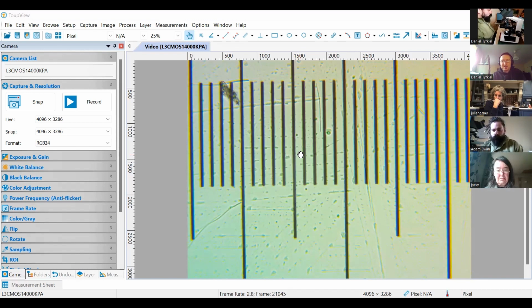Dr. Ingham basically teaches that you could use simply the smallest bacterium, and try to fit as many of the smallest bacterium across the hyphae mentally. But that means this is very much up to interpretation. So what I suggest to anybody who has gone through our lab, and Elaine actually agrees with me and is fine with this, is to use this to almost calibrate your eyes.